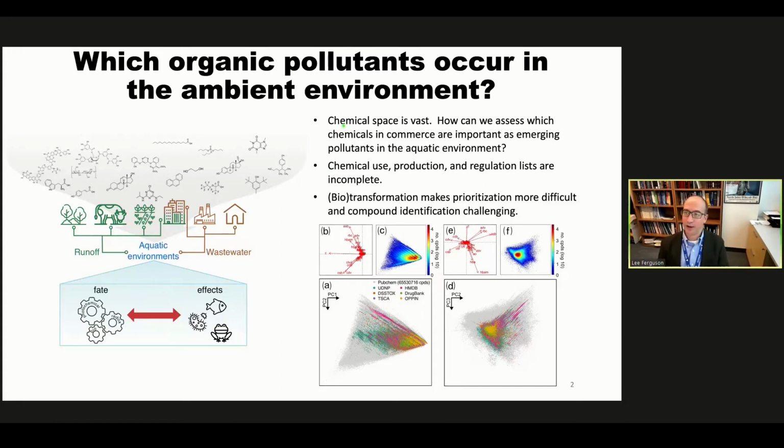And I would put it to you that in the science of exposomics, as we try to map out what exposures are most relevant for human health and environmental health, one of the critical questions that we need to ask is how can we actually map these complex mixtures that we are all exposed to. This is made challenging for those of us who are environmental analytical chemists by the fact that we really are facing a scenario with vast chemical space.